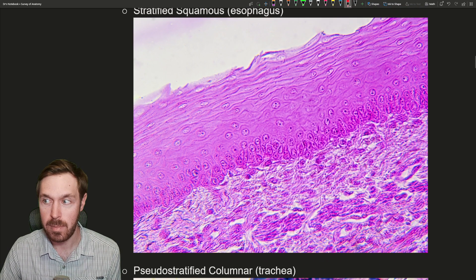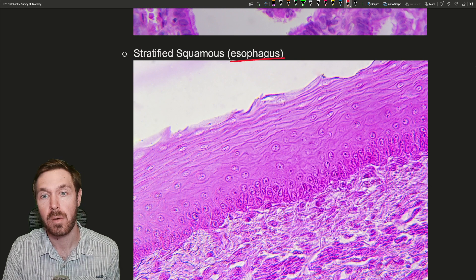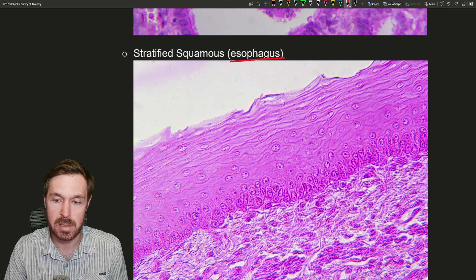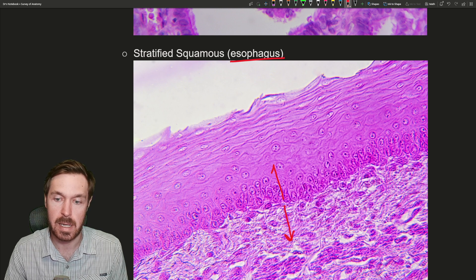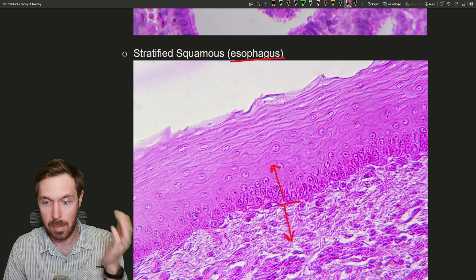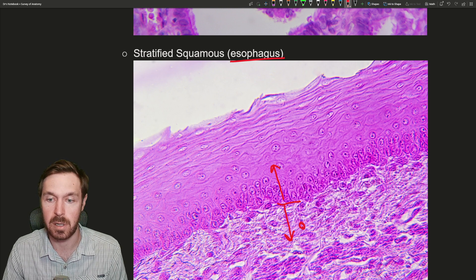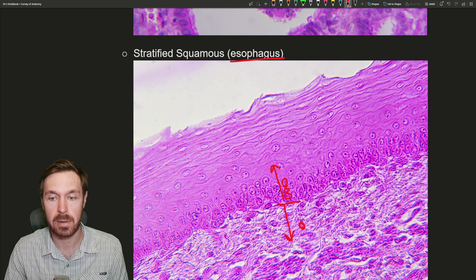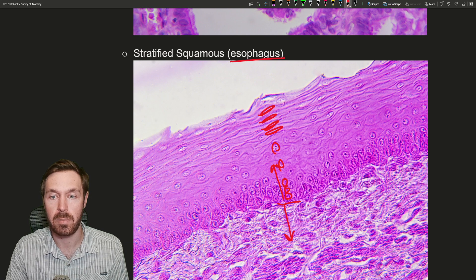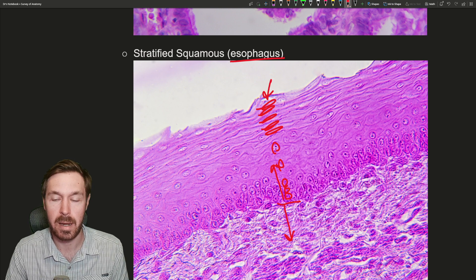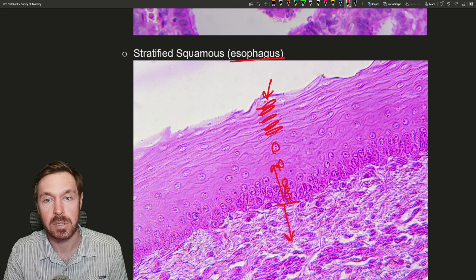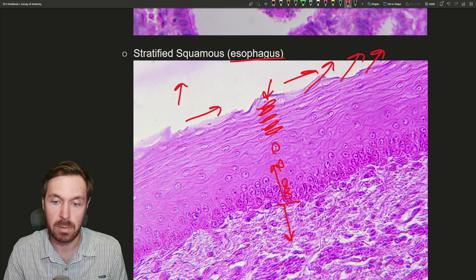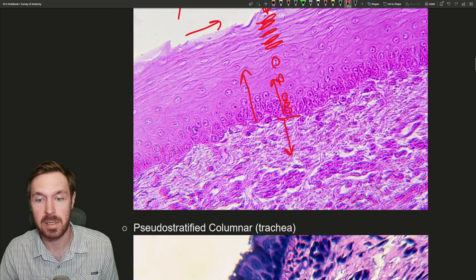Next is stratified squamous. This example is from the esophagus — the food tube that goes to your stomach. Another example of stratified squamous would be the epidermis of your skin. This lower region is connective tissue (the dermis), and above it is the stratified squamous epithelial tissue. We have cells down here that are dividing and working their way up, and as they do, they flatten. So we have multiple layers — that's stratified — and the apical layer is squamous-like. This occurs in areas with a lot of abrasion: as dead cells leave, new ones grow from underneath and push up as a protective mechanism.